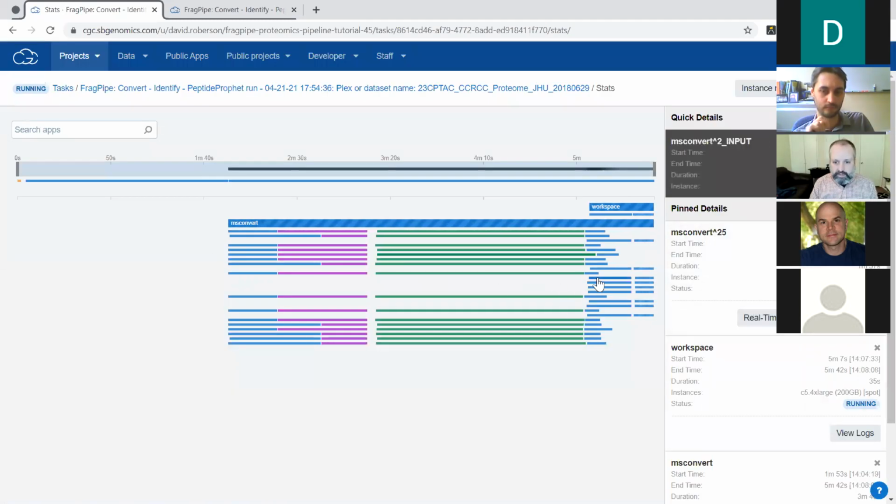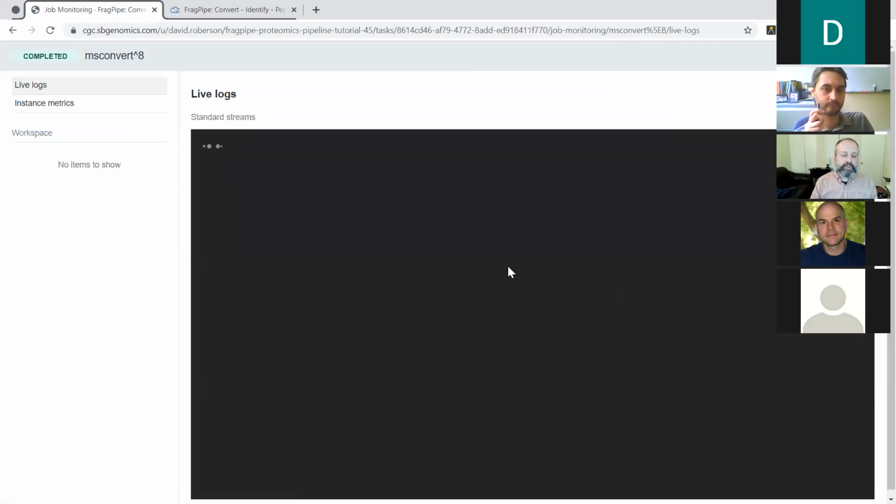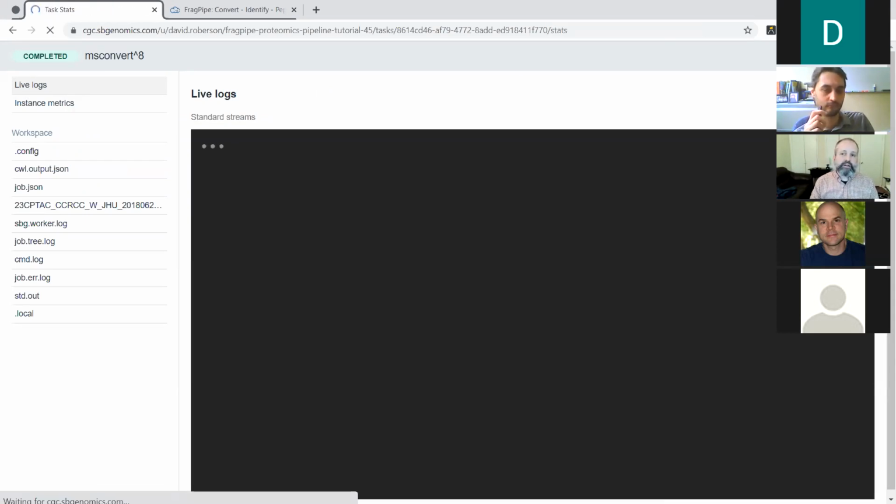Let me see. I just want to see if there's real-time monitoring. Yeah. So if a job is running, you can click real-time monitoring, and it'll bring up this screen. All right, so I wasn't fast enough. It's already completed, but you'll see the live logs there.